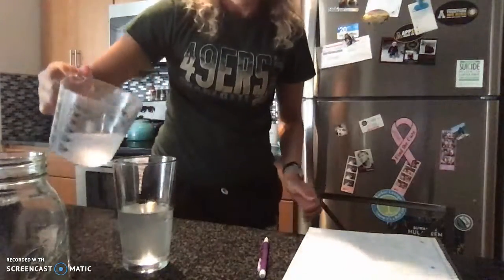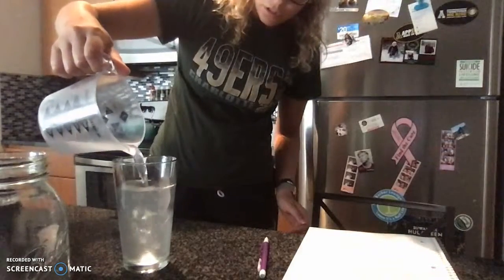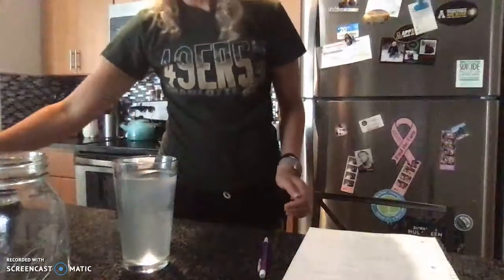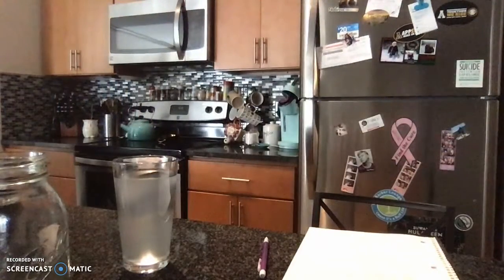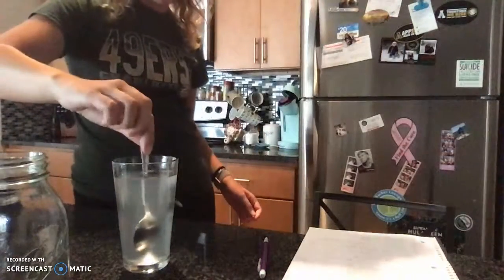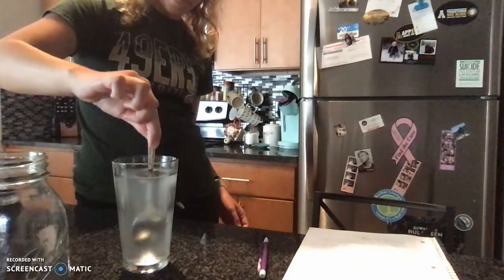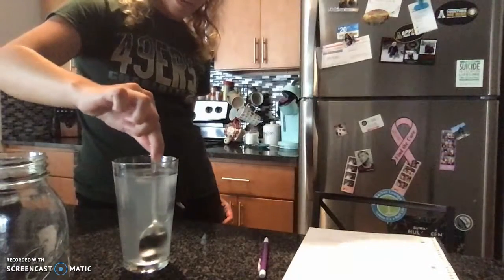And add that to the cup as well. We should just fill the cup just about right. Okay. So when we add those two together, we get a new spoon. We can then mix the solutions together, and it might take a couple seconds when the reaction starts to change, and the whole cup will change at the same time.